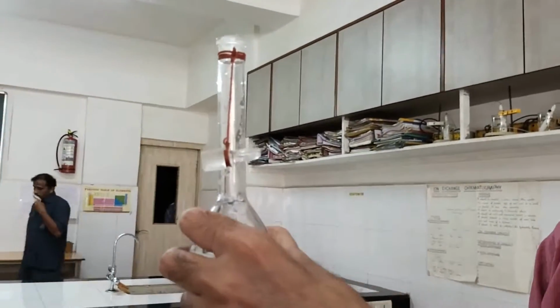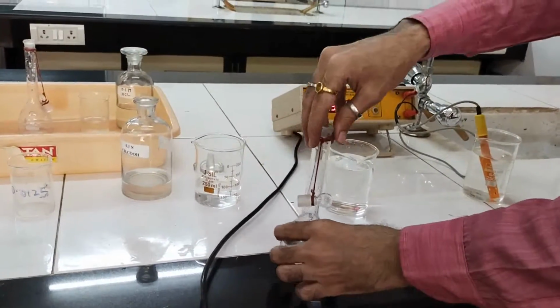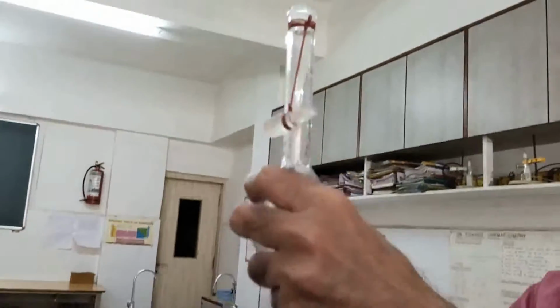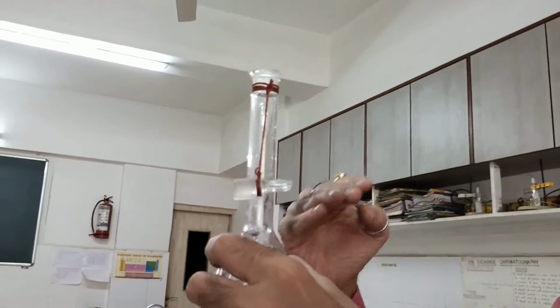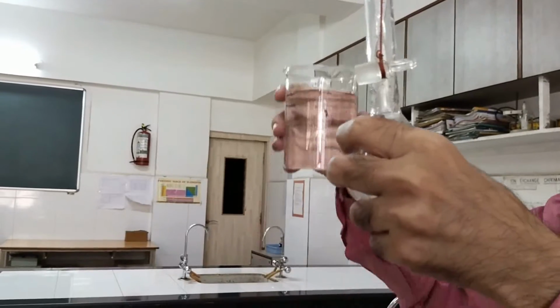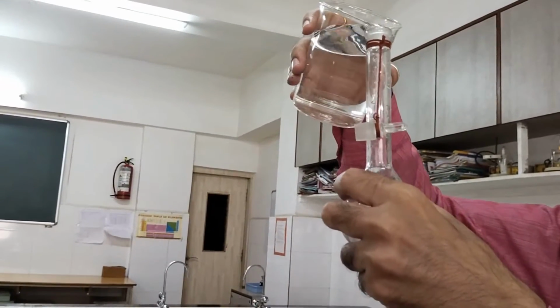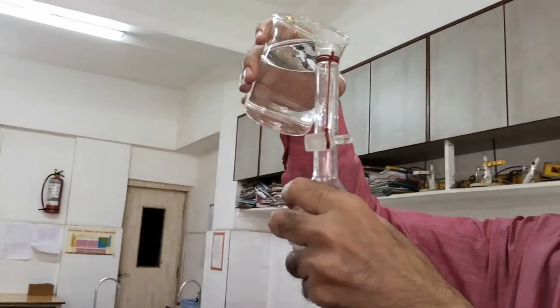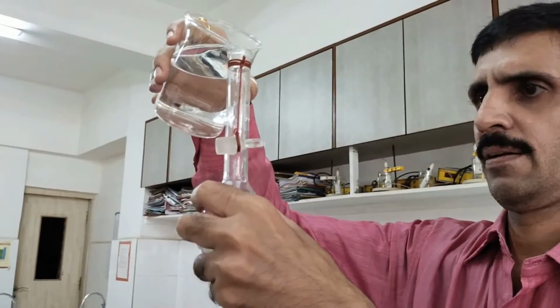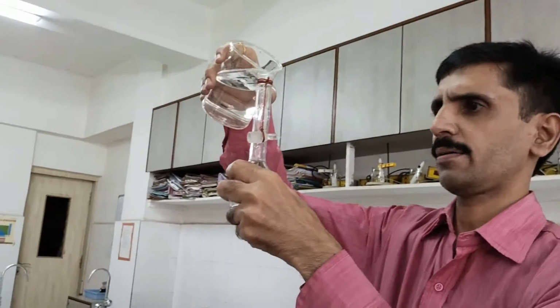your eye level. Okay, don't keep it down and then pour water from the top. No, that's not the right technique. So what we do is you keep it to your eye level, and then this is a conductivity water. As I already mentioned, in the entire experiment we are going to make use of conductivity water, and then we start the dilution process, keeping a close watch on the mark.